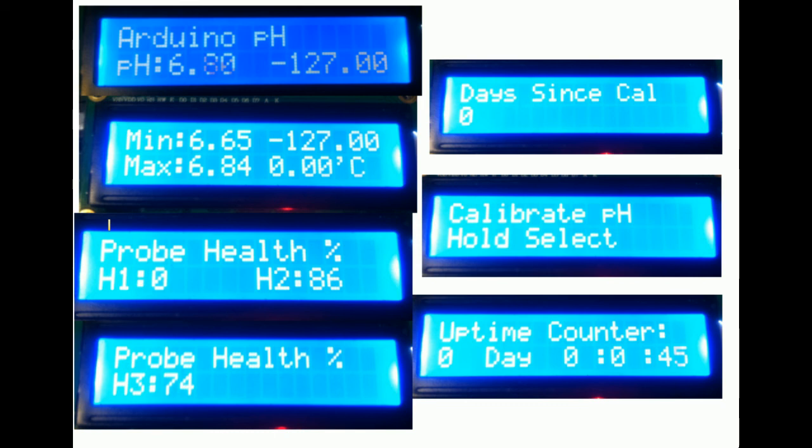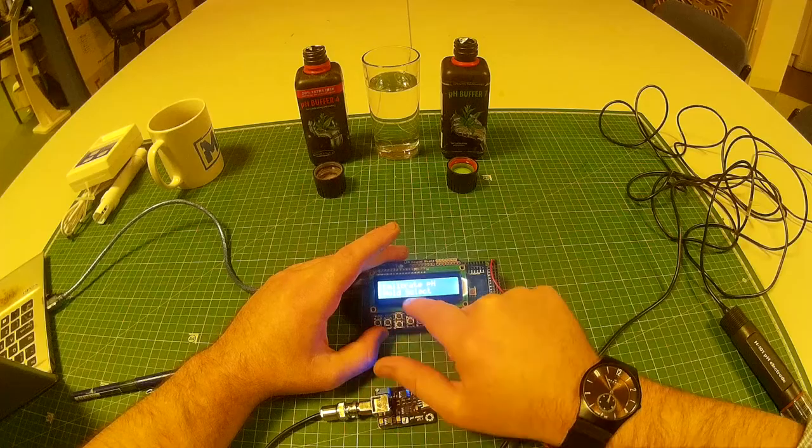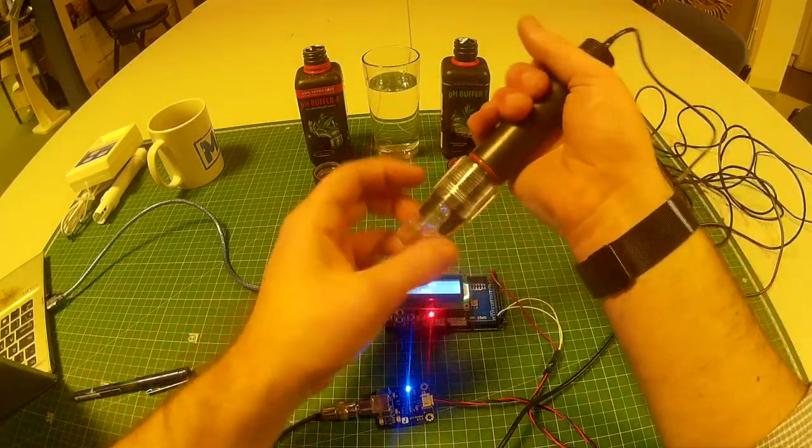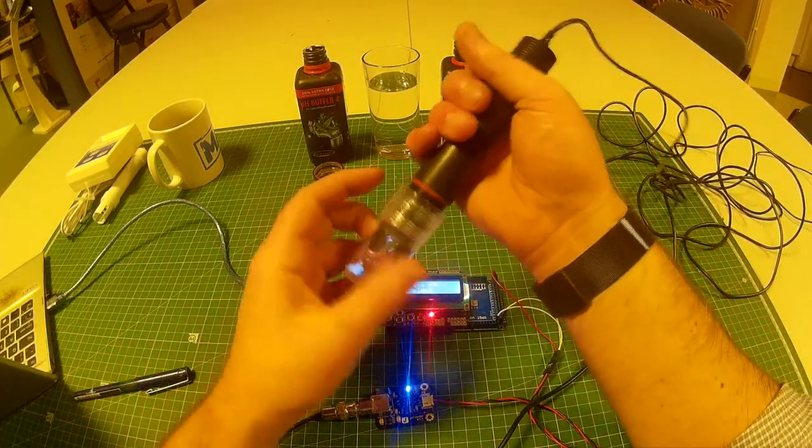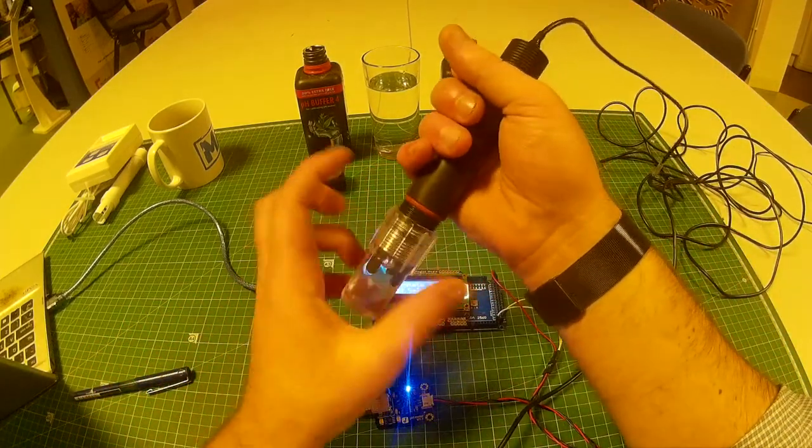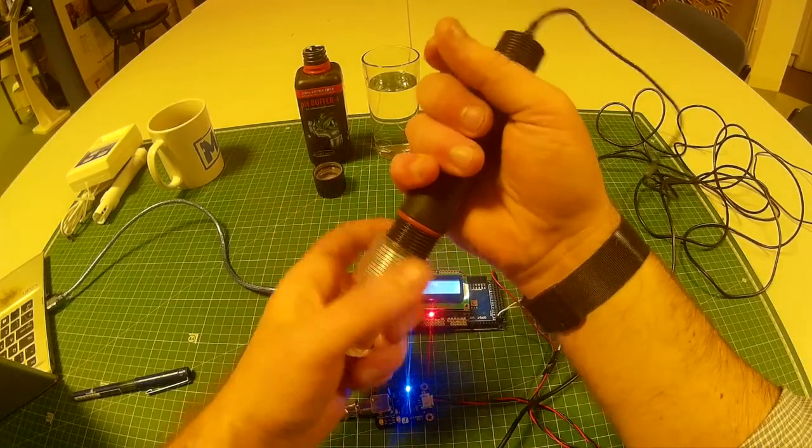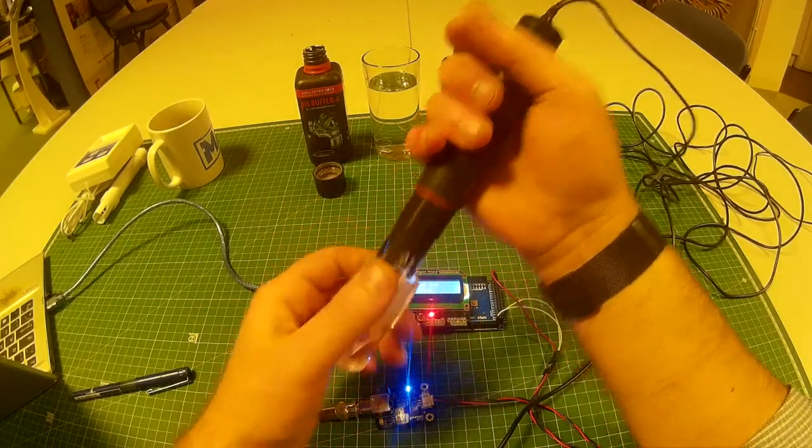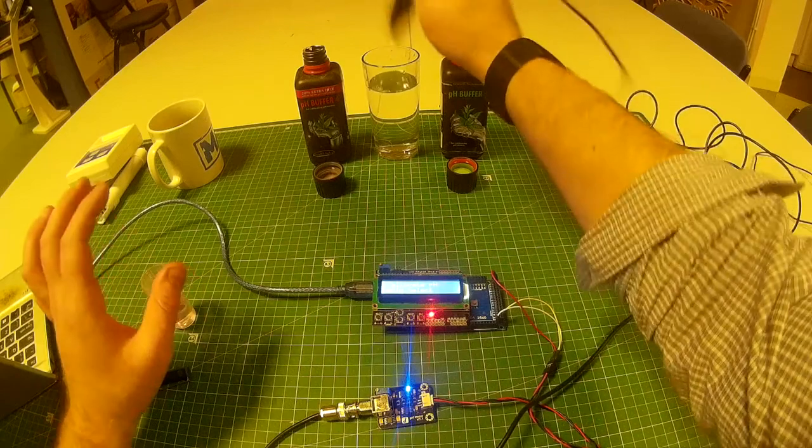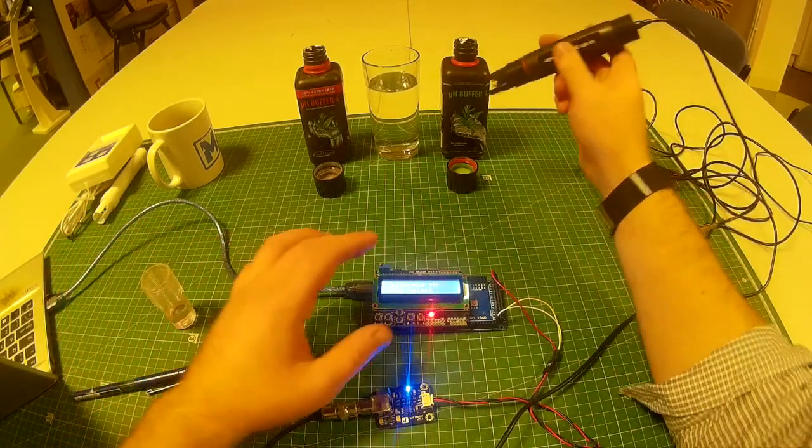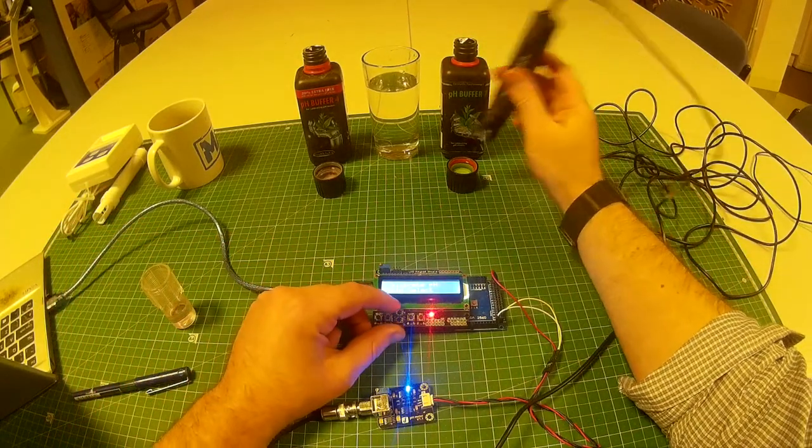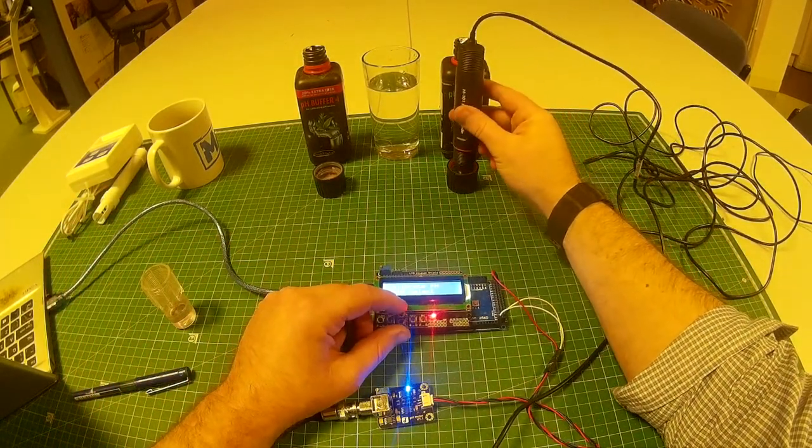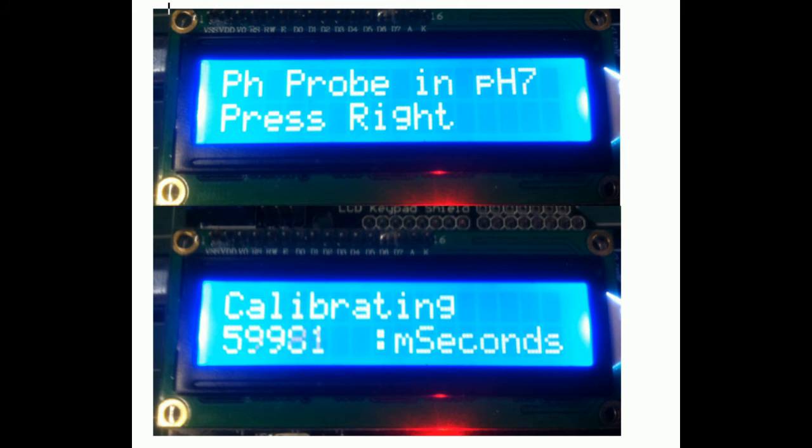You've got a calibration screen. You've got your days since calibration. It'll give you a warning if it needs calibrating. It'll give you an uptime counter. So what do we do? We come down to calibrate. Take your probe out, and like it says on the screen, hold select to calibrate. So just rinse your probe, put it in the pH 7 and hold select.